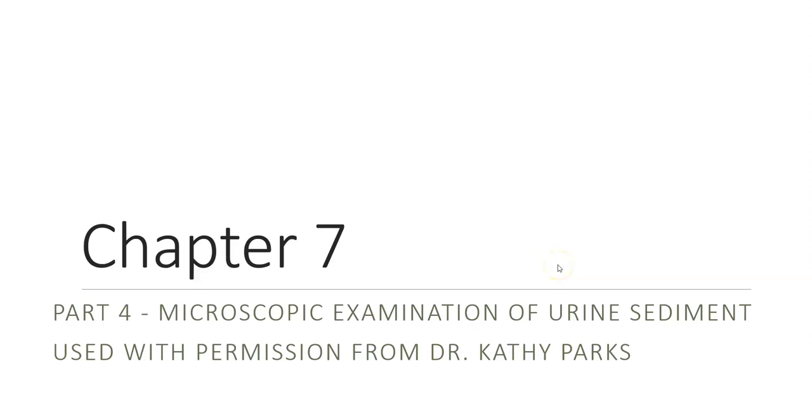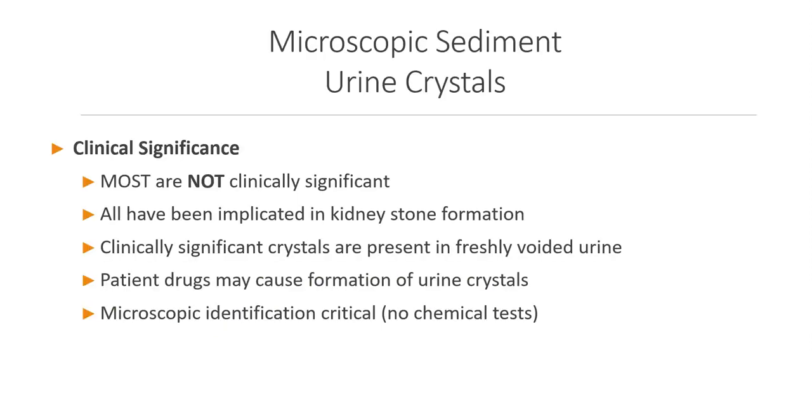We're continuing on with our discussion of Chapter 7. This is Part 4, Microscopic Examination of Urine Sediment, and it's used with permission from Dr. Kathy Parks. In this part of the discussion, we're going to focus on urine crystals.